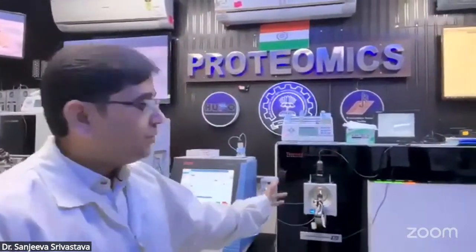We are using various types of LC-MS/MS based platforms. What you see in my back is one of the instruments, the mass spectrometers. There are a variety of mass spectrometers which can be utilized for different applications. One mass spec which we are showing you right now is known as the Orbitrap Fusion. This particular mass spectrometer can be utilized for deep proteome analysis. It means if you have a complex sample with thousands of proteins and you want to screen those proteins, you can utilize this instrument.